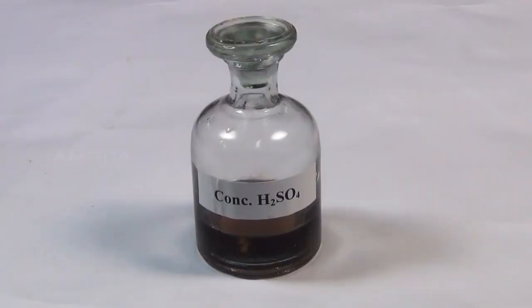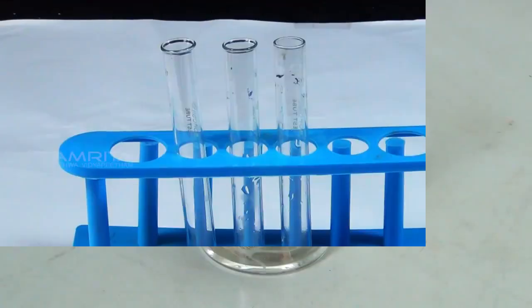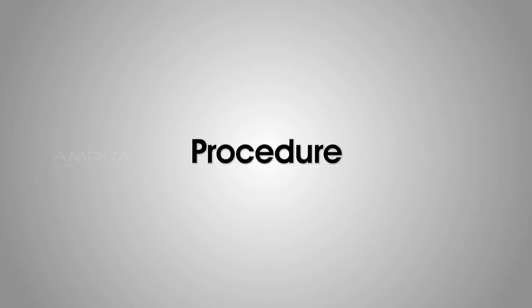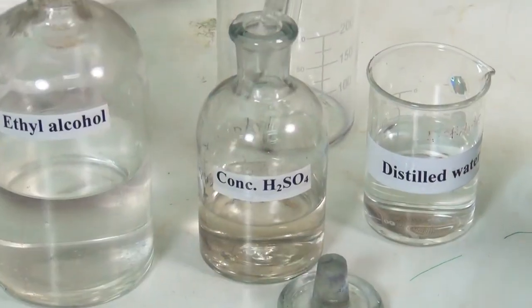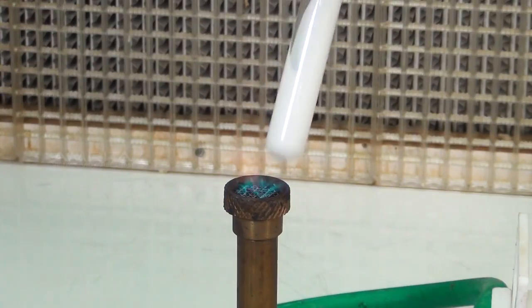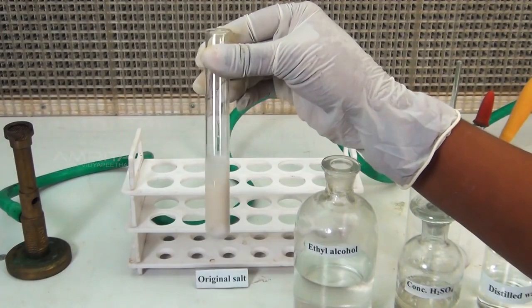Ester test. Materials required: original salt, concentrated sulfuric acid, ethyl alcohol, distilled water, test tube holder, glass rod, droppers and Bunsen burner. Procedure: take a small quantity of the salt in the test tube. To this, add a small volume of concentrated sulfuric acid using a dropper. Heat the contents of the test tube over the Bunsen burner. Now, add a small volume of ethyl alcohol using another dropper. Shake the test tube well.